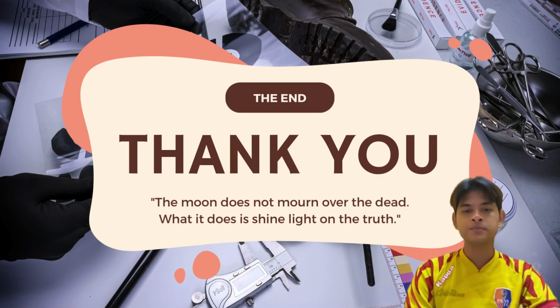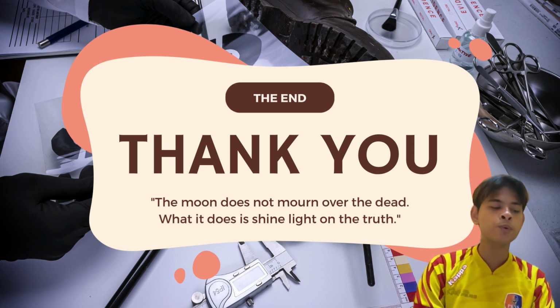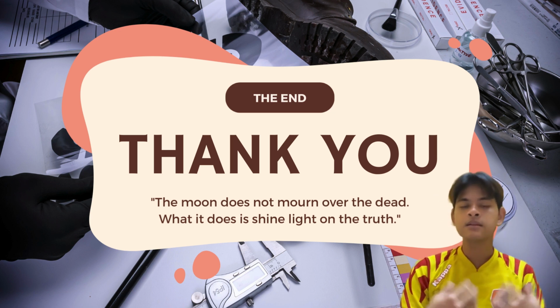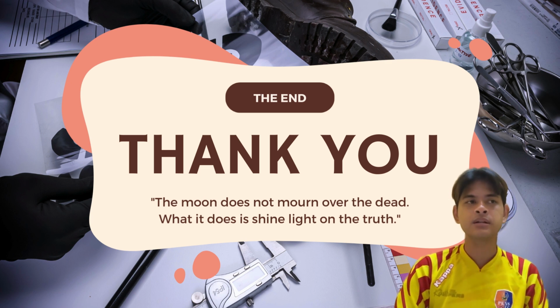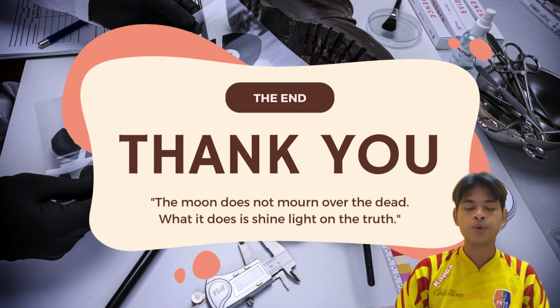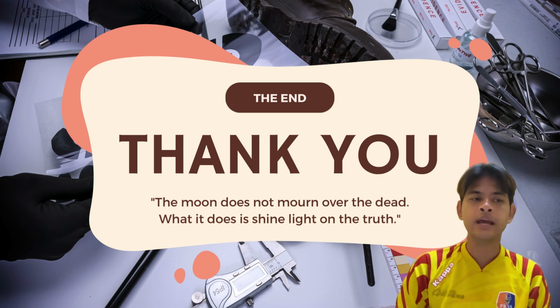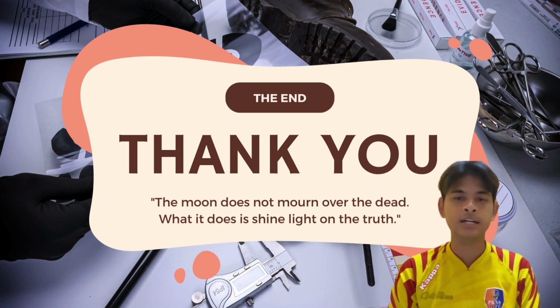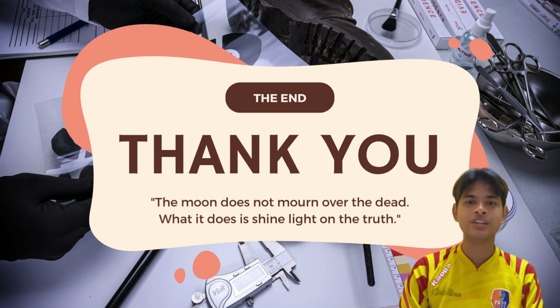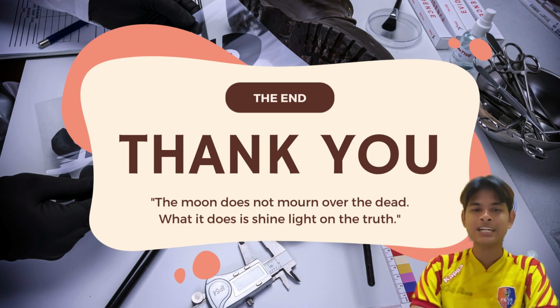So that's all from the chemistry unit, MRSM Kuala Klawang, where we invented a new kit for the students to have a better understanding in our subject. I hope that this small effort might give a big impact towards the students, and they can actually love chemistry and have a better understanding of chemistry. So that's all from us. Thank you.